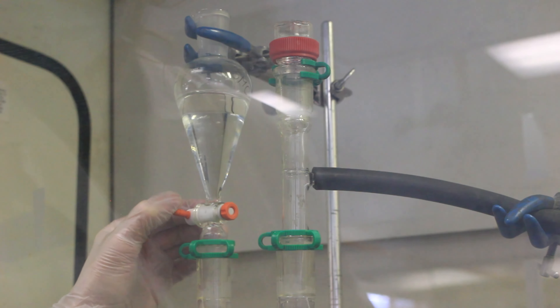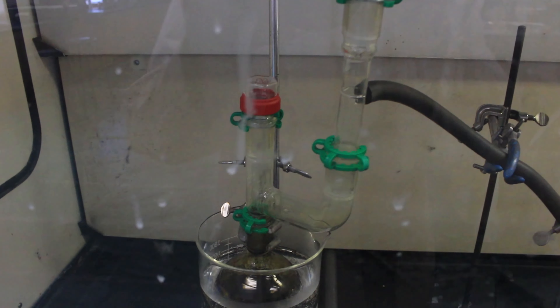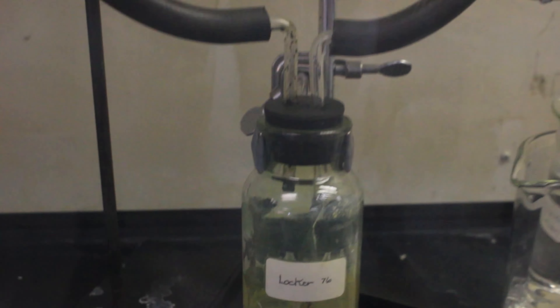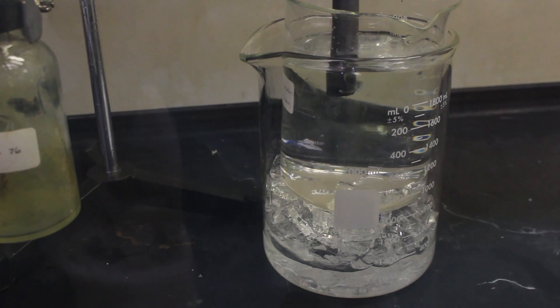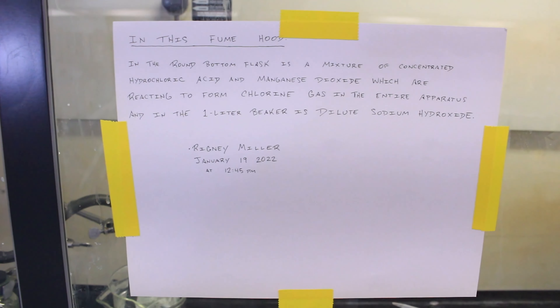The reaction didn't actually start going until I heated it — here it is in a water bath. You can see the yellow color of chlorine gas in the apparatus. This is actually really cool — it's my first time seeing chlorine in person. A few other students also let me know they thought it was really cool to see chlorine for the first time in their lives because of this project. What an honor.